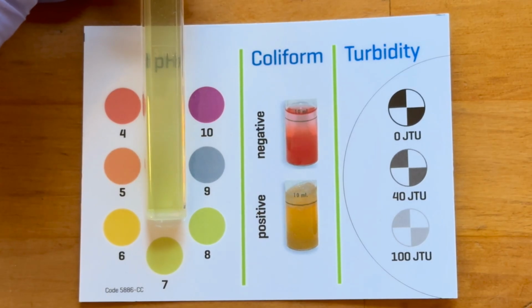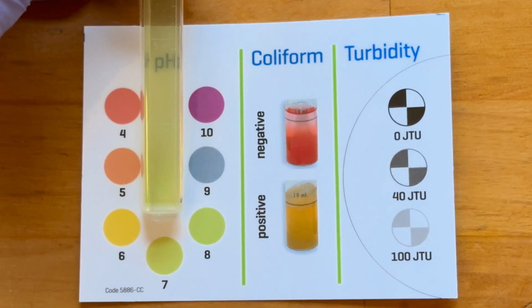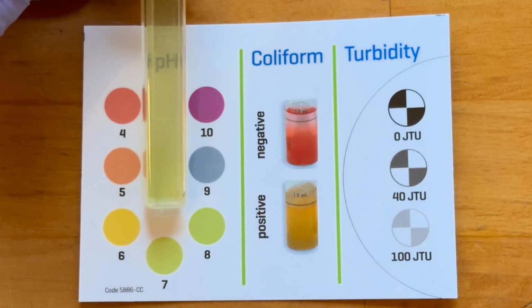And then comparing it to the color test here on the pH, I'm going to consider it to be 7 because it's a little bit lighter than the pH of 8.